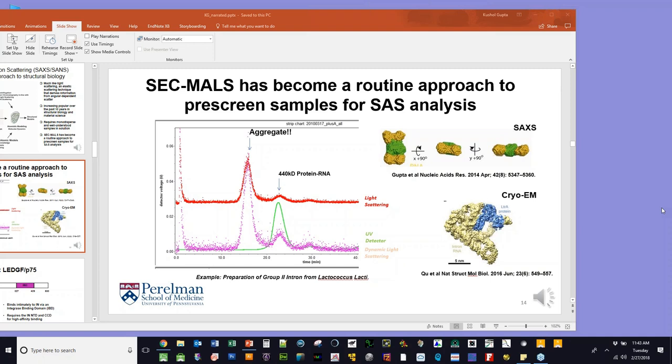Okay. So next question is, how do you measure the size of protein particles that are below 10 nanometers? And I'm going to add another part to that question. Can you use those measurements to constrain your SAXS reconstructions? Yes. And to some extent, yeah, so typically when I'm characterizing a macromolecule in solution biophysics, I try to bring as much information in as possible, right? With regards to something that's modest in size, something below 10 nanometers, many proteins fit that. SEC-MALS is very important to see if it's self-associating, all right, in a concentration-dependent fashion.